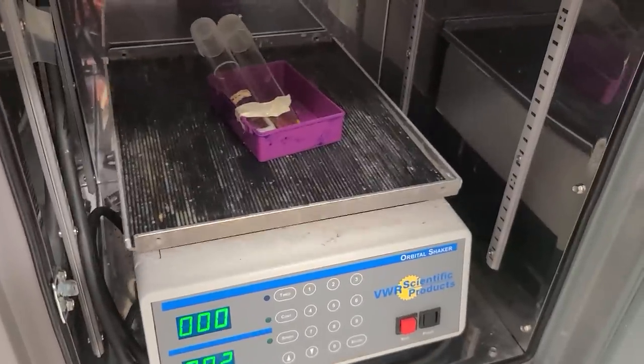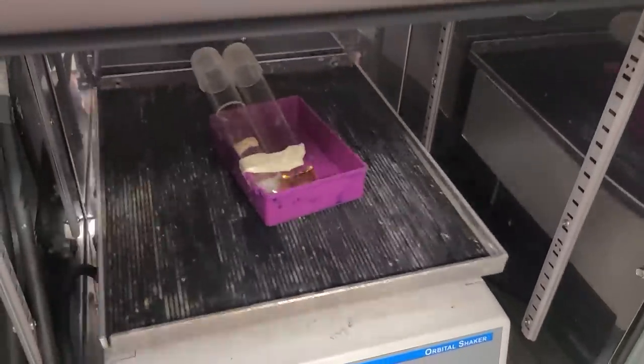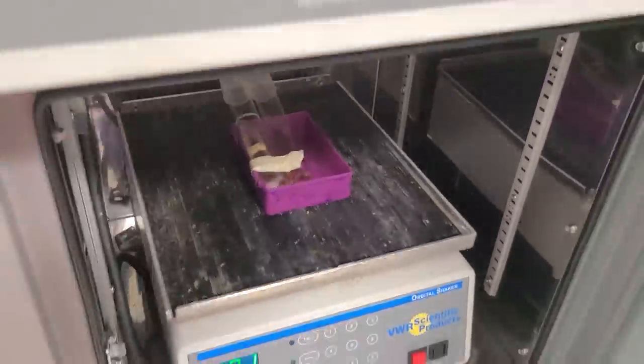So this is going to shake overnight. It shakes so that the bacteria constantly mix with the air, because they actually need that, like those bubbles and stuff. They need all that air to breathe and grow. You know, something close to breathing, it's fine. Come back the next day and we'll see what happens.